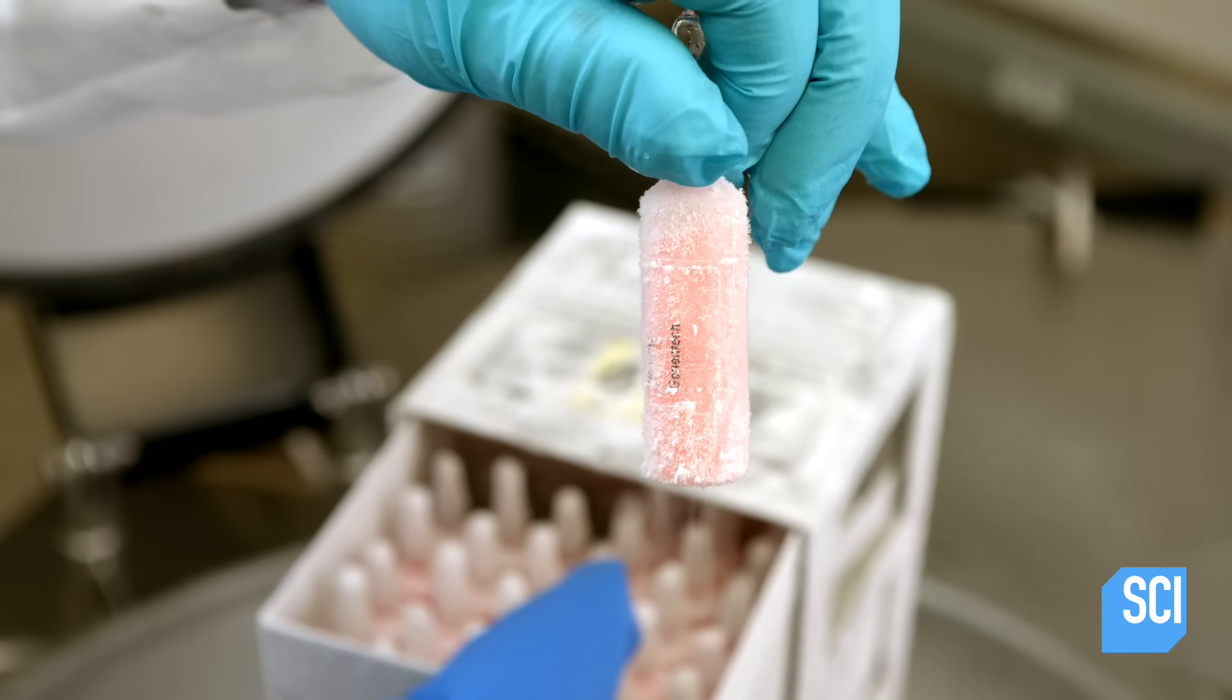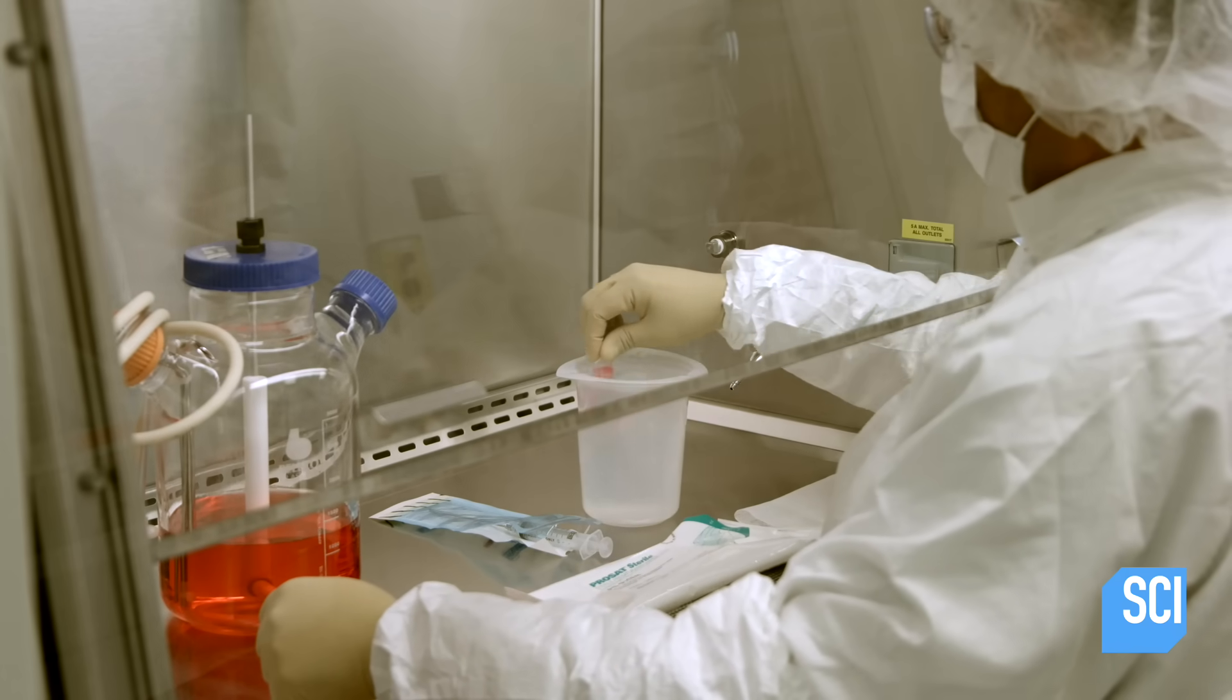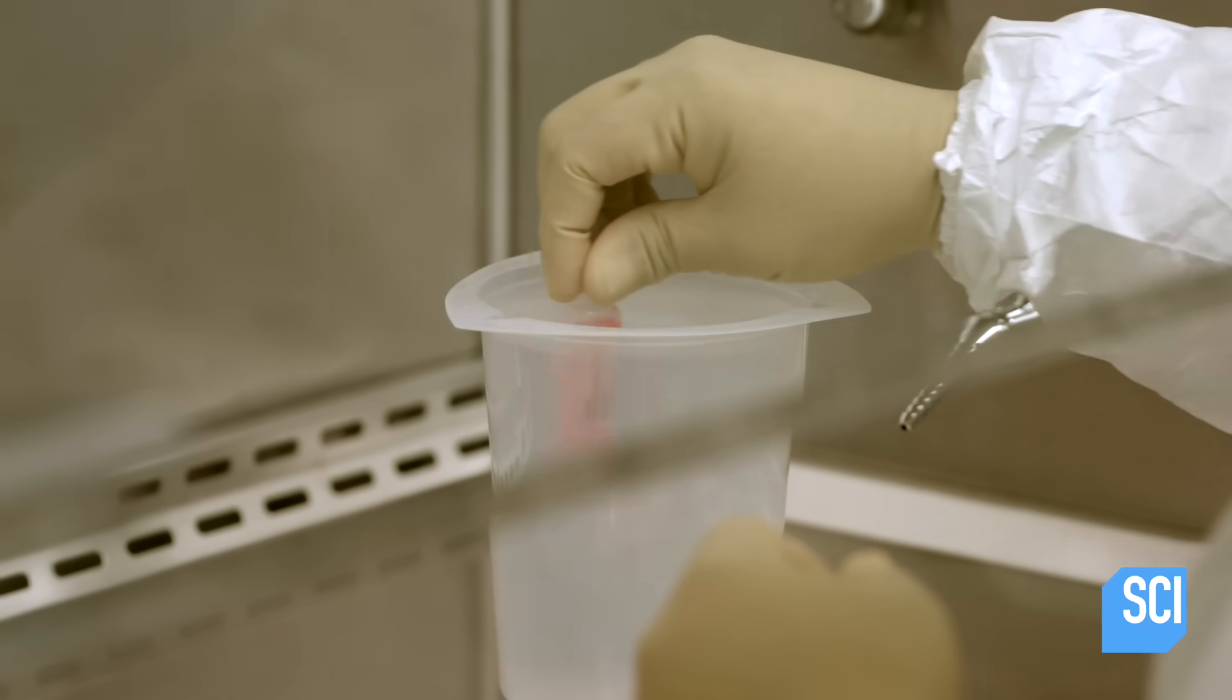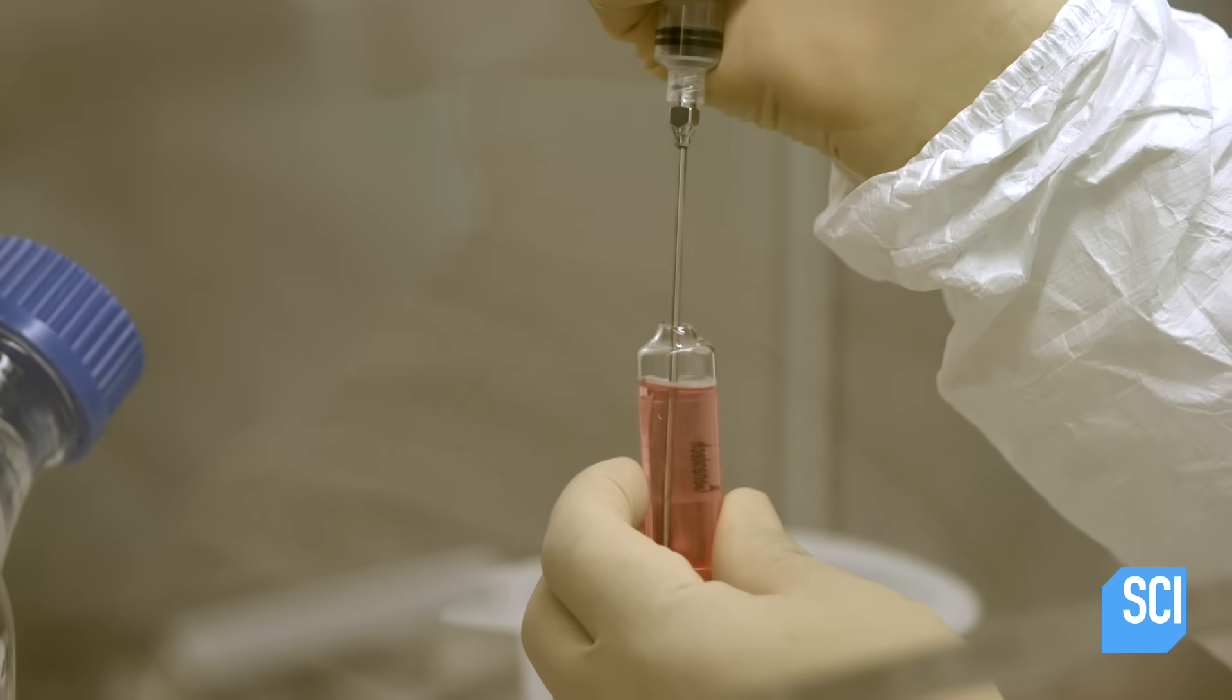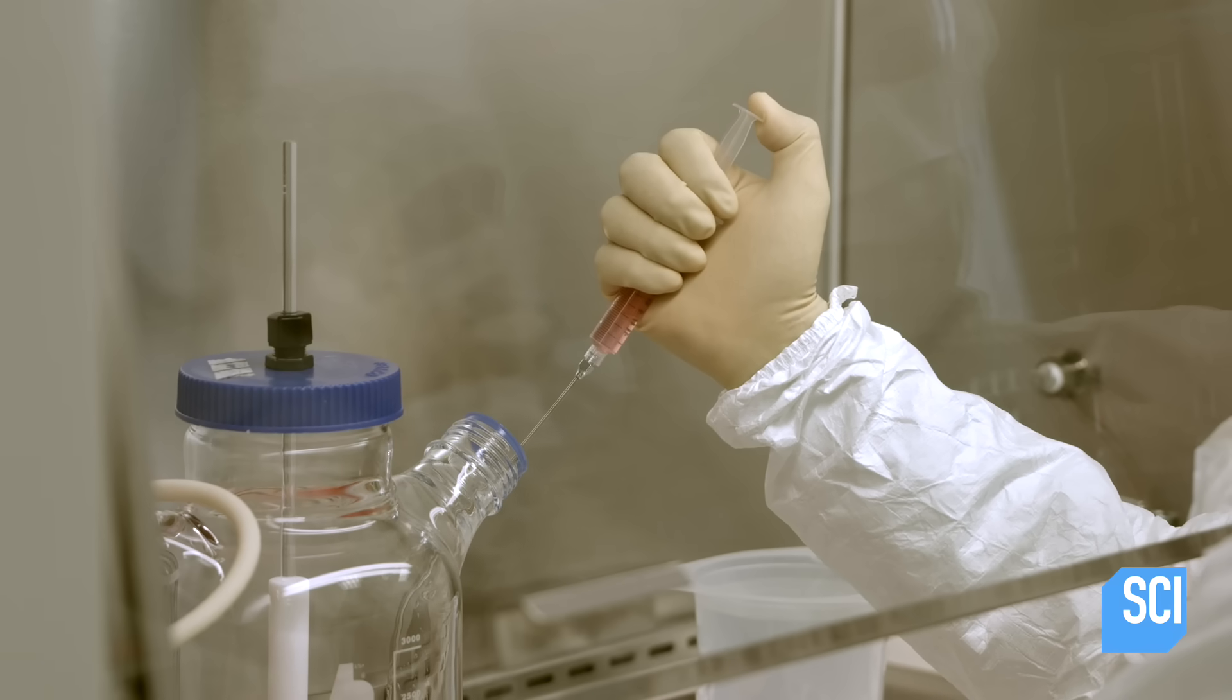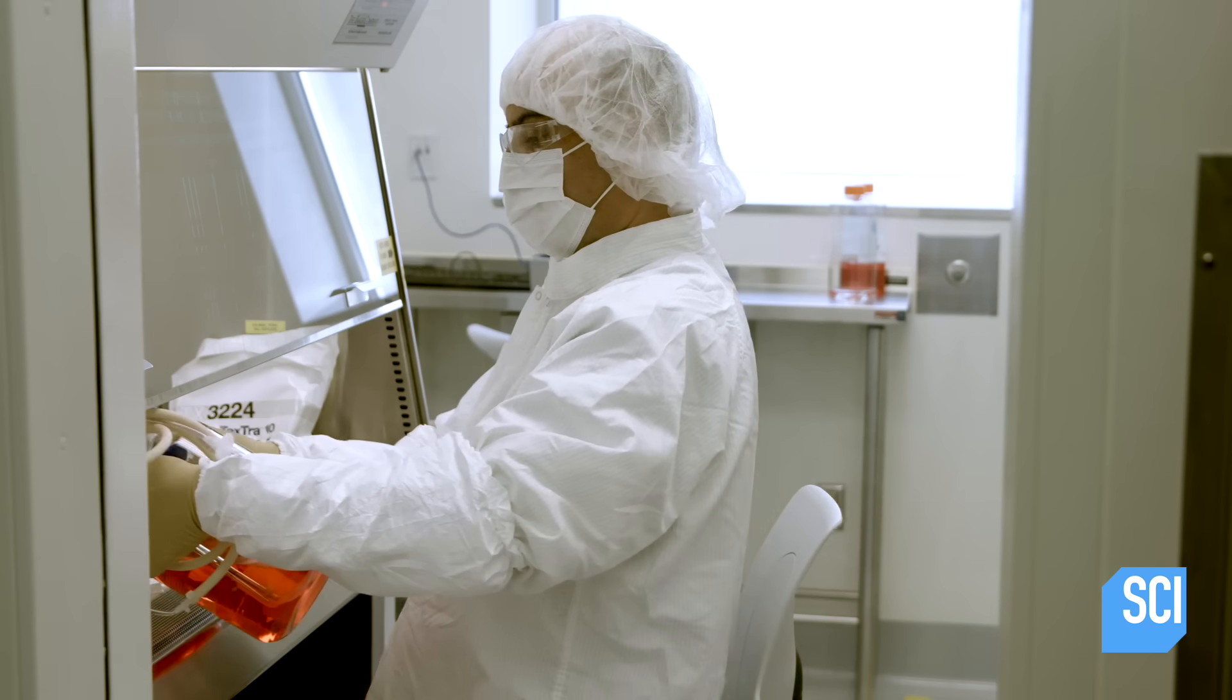In the seed lab, a technician thaws the cells in warm water and transfers them to a glass flask that contains growth media. The growth media is comprised of hundreds of nutrients, including vitamins and minerals.